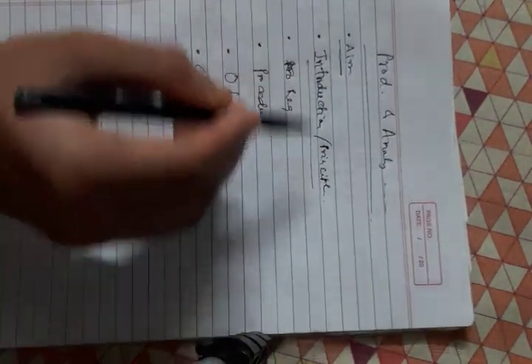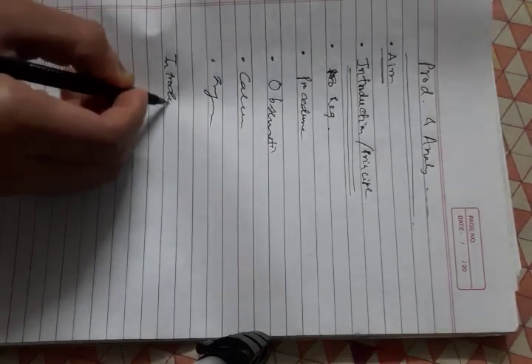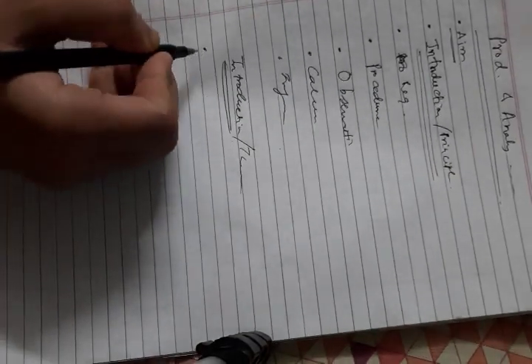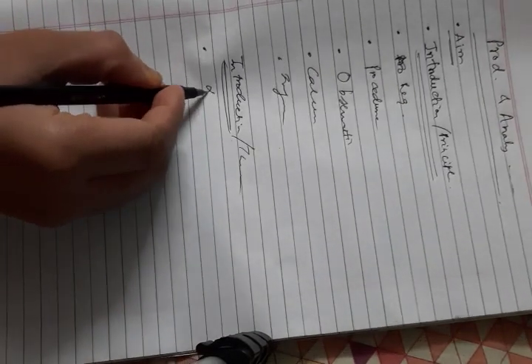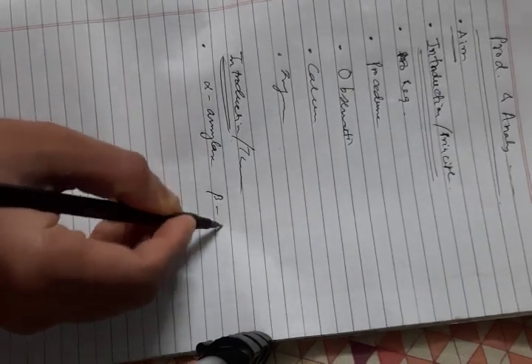Then the principle. First, the introduction or the theory. Amylases are of a variety of types. One is alpha amylase, and there is beta amylase.